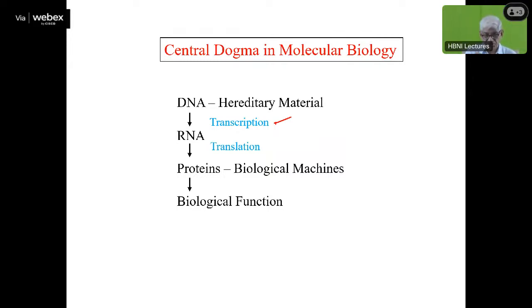What do we know about these structures from these different techniques, and how do we use NMR to characterize these structures? For things which are happening in solution phase, we use NMR. X-ray crystallography produces the structure in the crystal or in the fiber, things like that. And NMR can also be used to determine the structures of molecules in solution phase and understand the dynamics of those molecules in the solution phase.